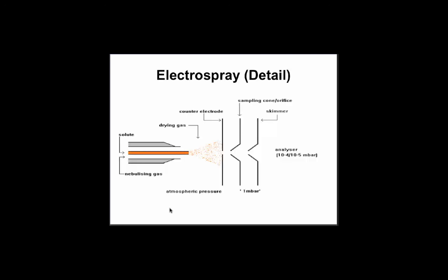In electrospray, it's a little different. The solution is sent through your HPLC system into a very narrow column, and then you send also some gas around, so there's sort of a sheath of gas surrounding your capillary, and it heads out into an empty space, atmospheric pressure. But it's not unlike an aerosol can where you spray things. And as you spray things out of this very narrow tip, you also send it into progressively lower atmospheres or higher vacuum. And so the droplets essentially evaporate.